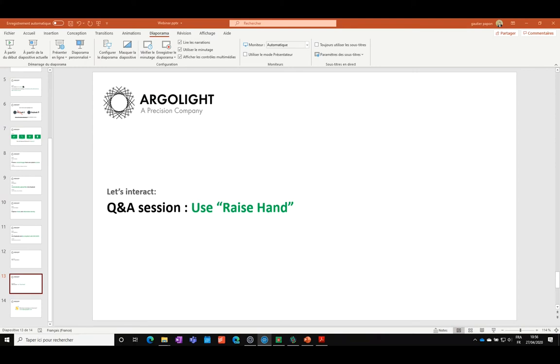The next question is, is batch analysis available for the field of ring, the 4x4 intensity, and 3D cross patterns? What about all the other patterns on the slide? So there is already a text answer to that. So we'll just read that. For the moment, batch analysis is only working for these patterns and the associated tests, but we are working, of course, on more possibilities. And of course, if you want us to implement new patterns, you can use the poll. Or just send us an email saying, yes, I would like very much these tests to be added in the batch analysis.